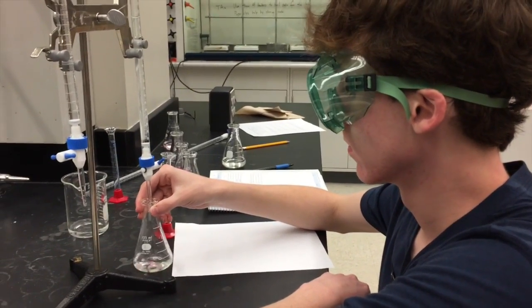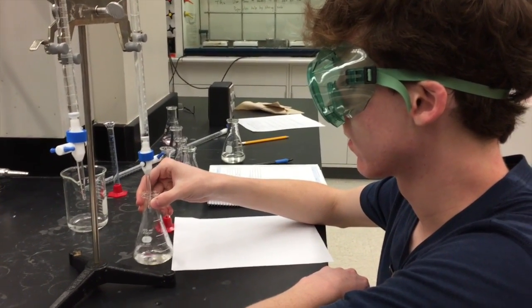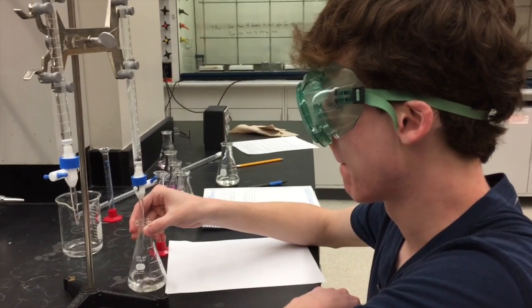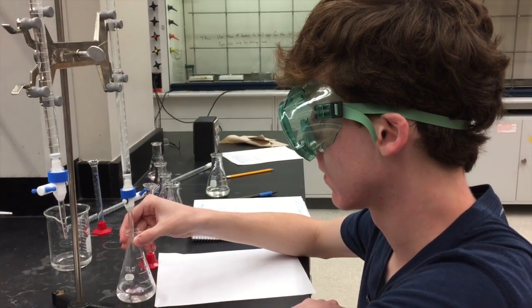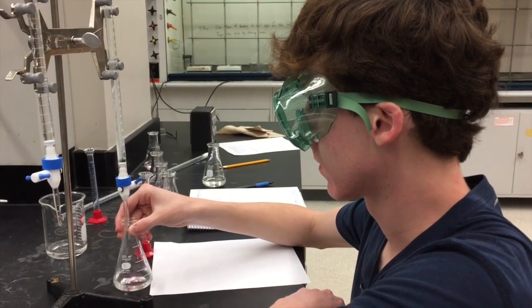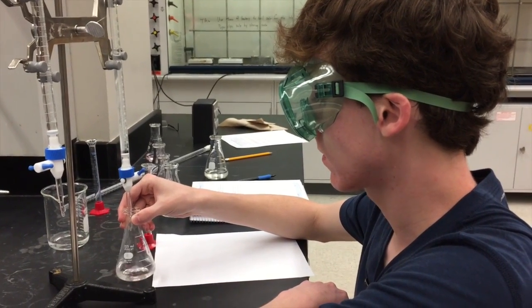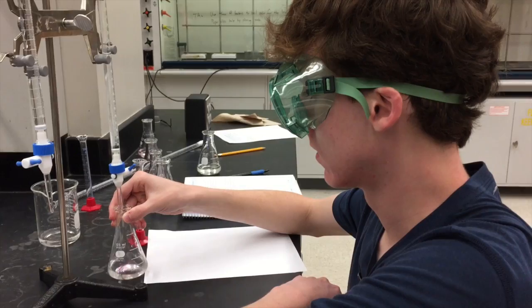Rinse out the burette with water and use a small amount of sodium hydroxide, or whatever solution is intended to be in the burette, to prime it. Rotate the burette with the solution inside so that the inside can be coated with the solution. Repeat this three times.